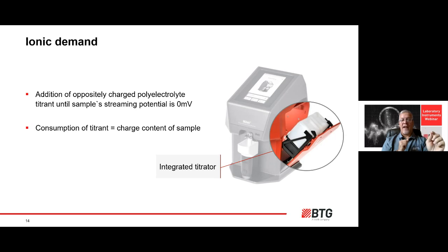The consumption of the titrant in milliliters that it took to get to that point is the reported value. And that's how you're getting your output from the water phase and the particle charge detector, in milliliters. How many milliliters of titrant did it take to neutralize that material?